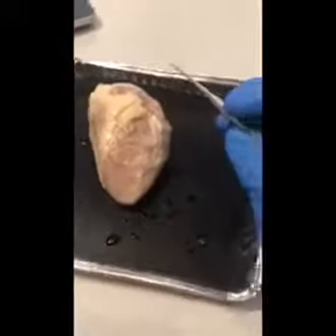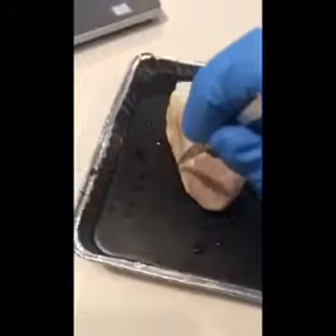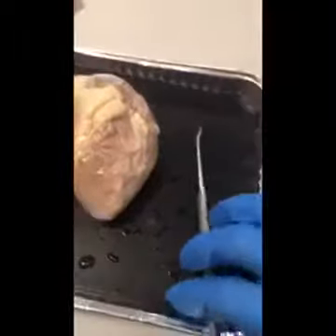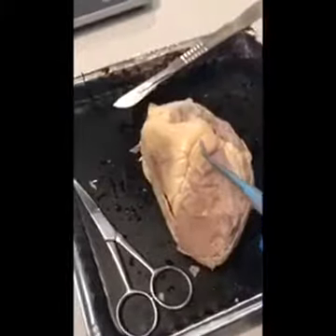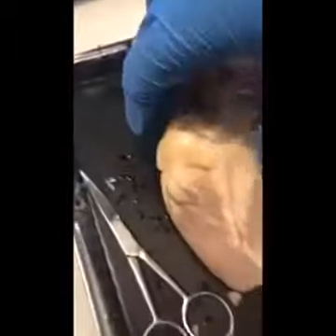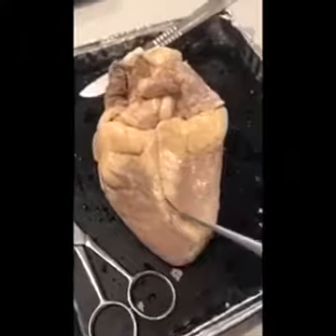Okay, so looking from an anterior view, over here will be the right ventricle, and over here will be the left ventricle. Ventricles are the lower chambers of the heart that are on each side of it. Right here, this little groove is the interventricular sulcus, and if we turn it around, there's also one right here through the middle on the back.